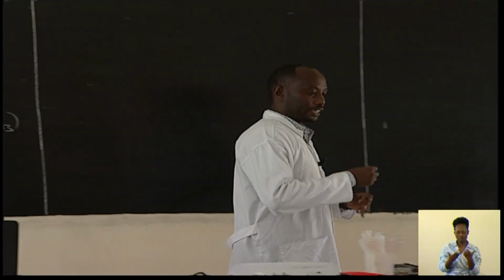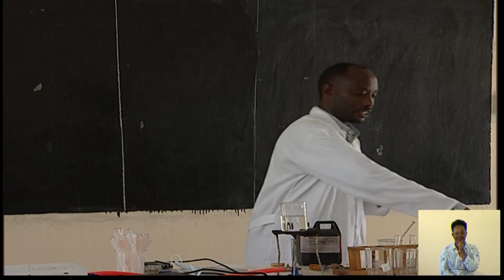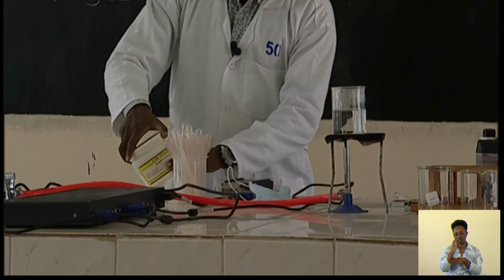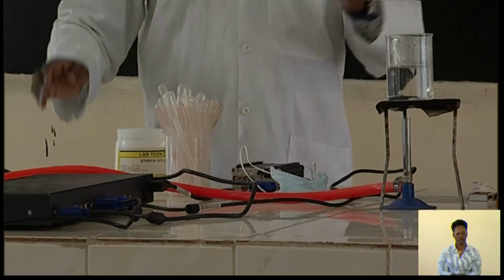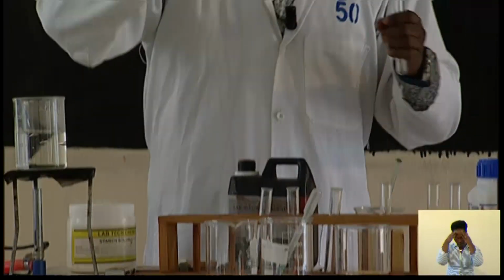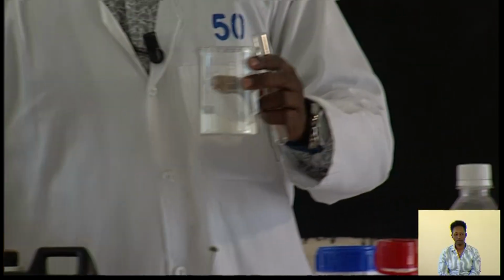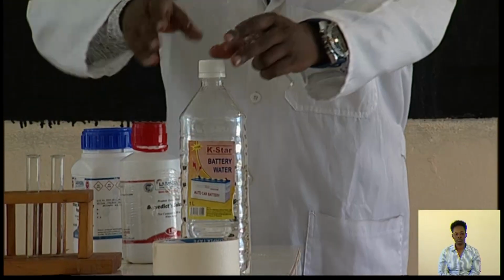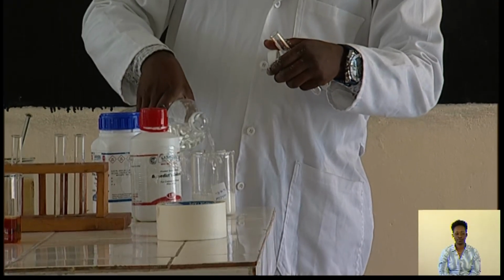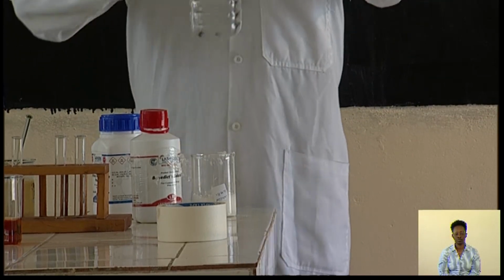That's what I'm going to do. I'm going to get a test tube. After getting the test tube, I'm going to prepare a starch. This is a prepared starch. Then after getting the starch, I test if there is presence of starch, and then I make a conclusion. I get a test tube, I get a beaker, then I add some starch there. This is the starch. Then I add some water, and I'm going to conduct the two of them. Then I have to stir.